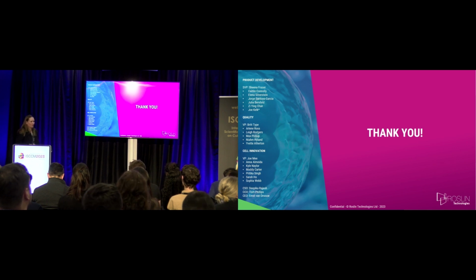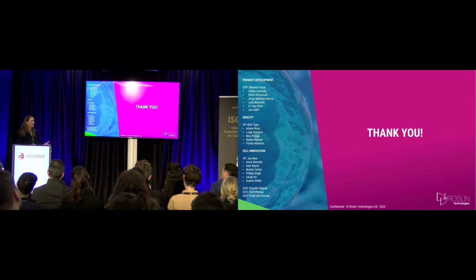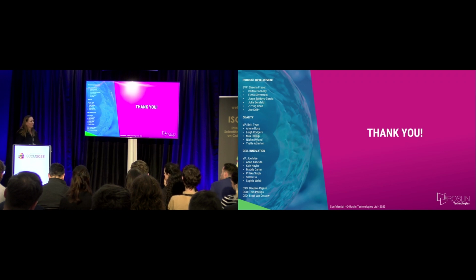Yeah, so the distinction between those two is that the 3 liter one was a microbial system where the dimensions of the impeller width and depth and the vessel volume were slightly different. So the shear properties were not as high. That reactor was also run at between 100 and 120 RPM in that environment to keep the cells suspended. They were maintained in suspension at those agitation rates. When we applied those same conditions to the smaller scale, the 100 to 120 RPMs, the aggregates settled out. So we had to increase the agitation, and through that process, we saw dispersion. So there's a lot of factors that are changing between those systems that we need to figure out what exactly we can control going forward.